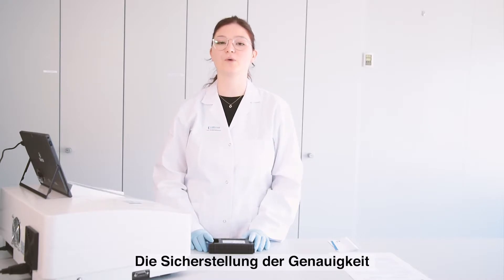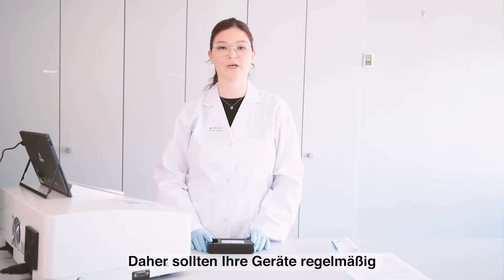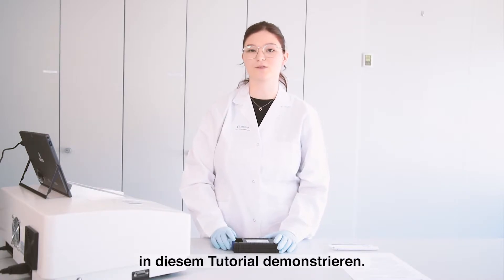Securing the accuracy is very important and therefore the instruments should always be checked in a frequent manner. The procedure is a simple one and we will be demonstrating it today in this tutorial.